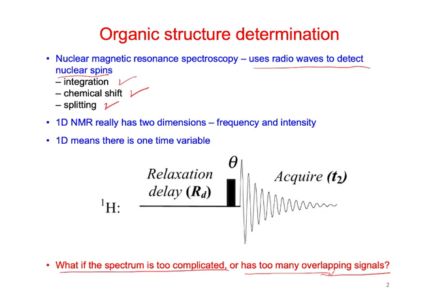Really, one-dimensional spectra have two dimensions already, because they have a frequency for chemical shift, and they have the intensity for the integration. But when we talk about NMR, one-dimensional means that the pulse sequence has a single time variable. So that's the dimension.